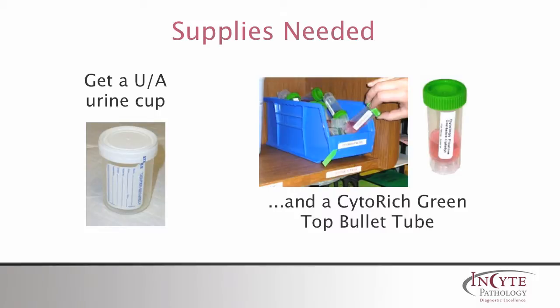First we need a standard urine cup and a green top bullet tube with cytology fixative from your supply area. The urine cup will hold unfixed fluid, and the bullet tube will hold fixed fluid.